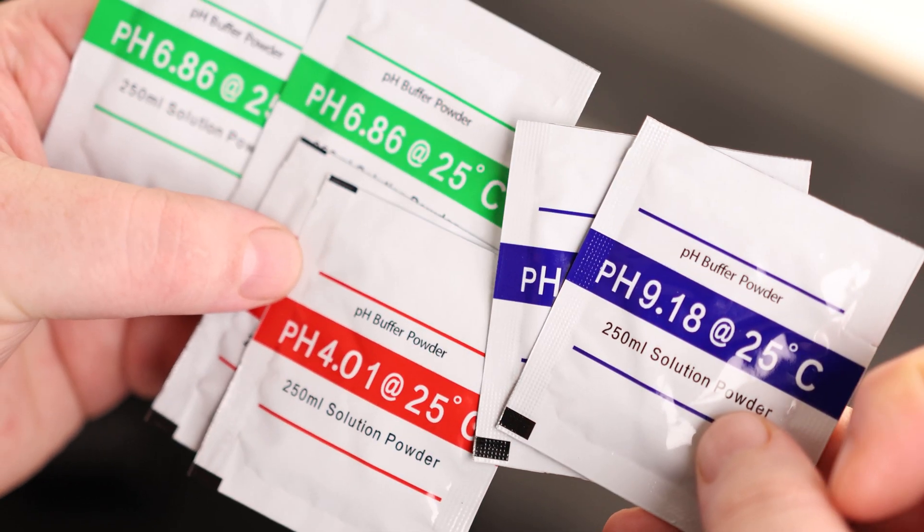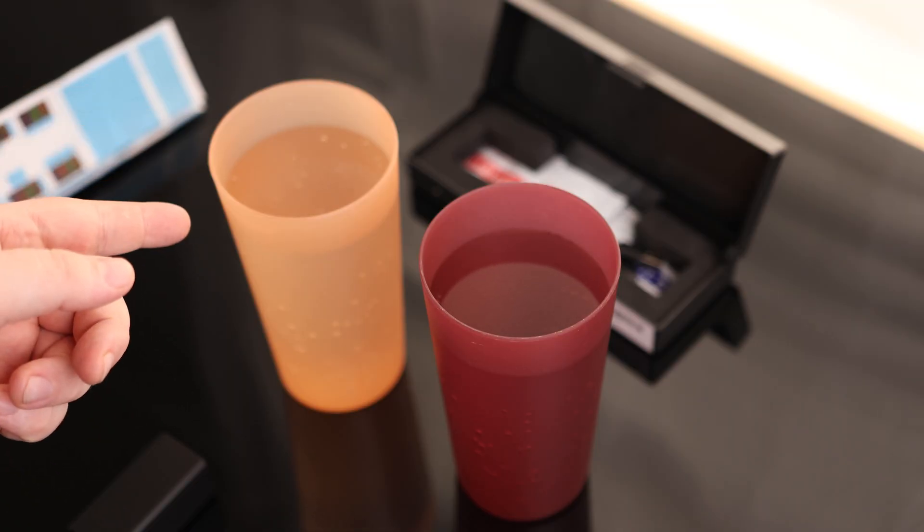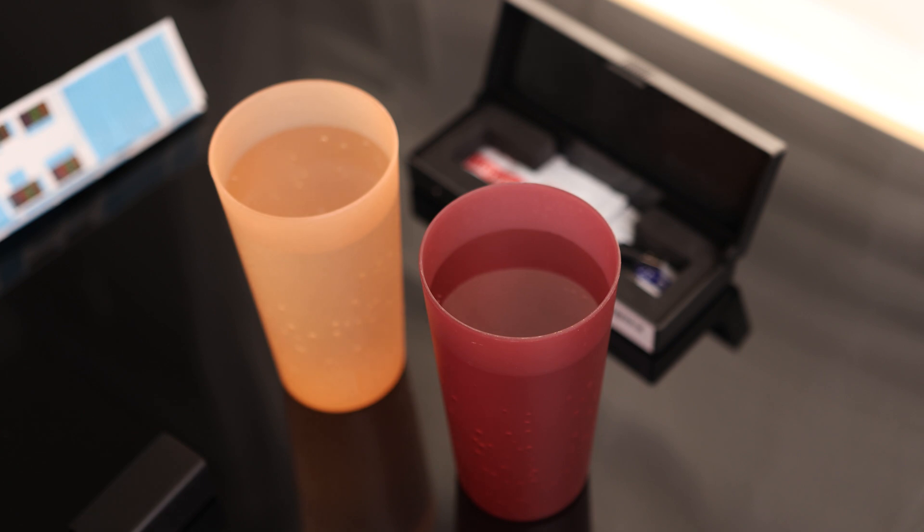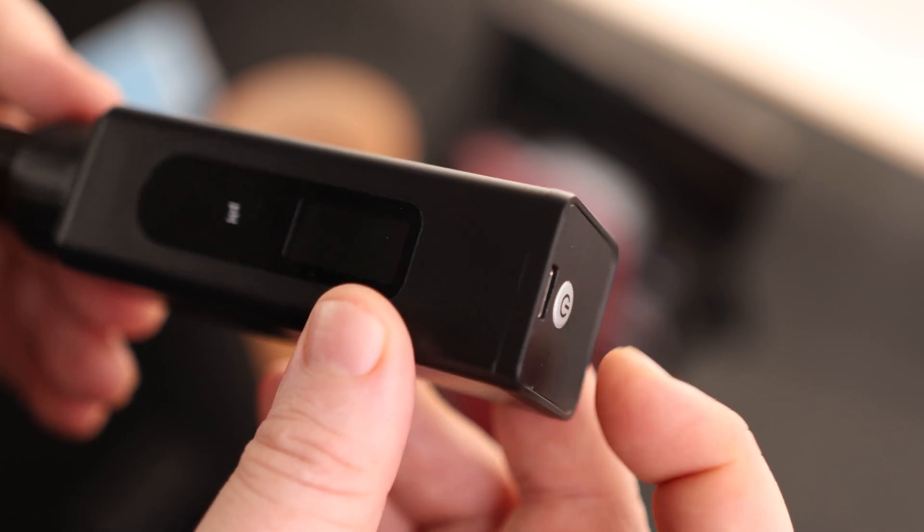We can use these for making sure the machine is calibrated. So here I have a couple cups of water — this is tap water and then this is directly from my fridge, so it's running through the purifier. I want to see if there's really a difference in those. I'm going to press the power button to turn it on.